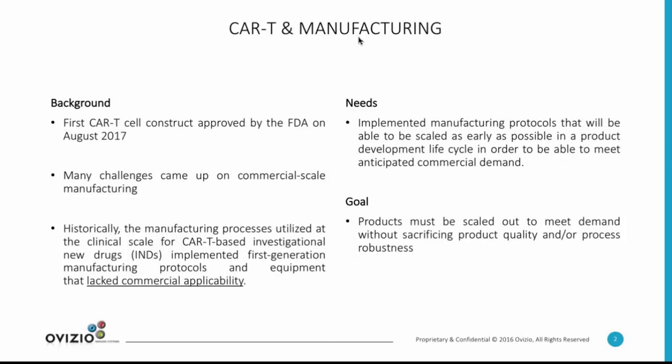So at the moment we need something on the manufacturing scale, new protocols that will be able to be scaled up as early as possible in the product development lifecycle in order to be able to meet the anticipated commercial demand, of course. So the products must be scaled out to meet demand without sacrificing the product quality and the process robustness.